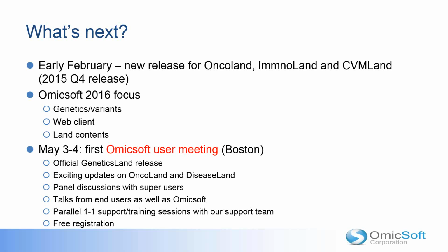And we'll continue to increase the value of the land content. We essentially have plans to double, even triple our efforts on different land contents. One example is that we have been working on DNA-seq genome mutation on different projects that previously we didn't actively do, we just imported, but now we actually process.